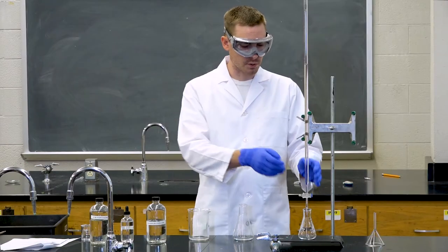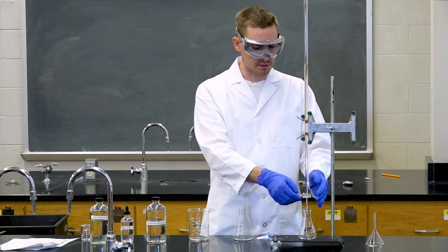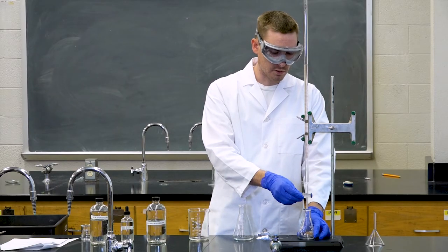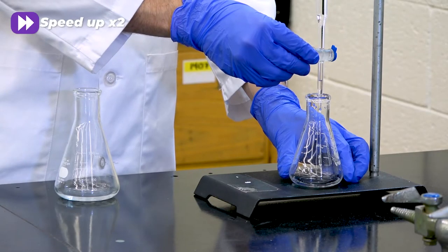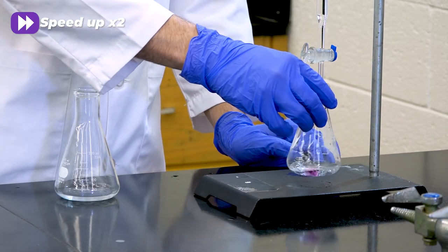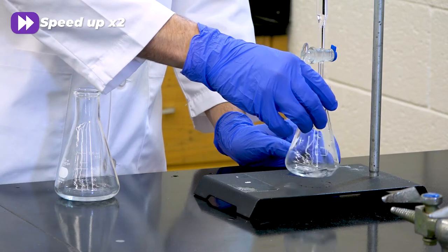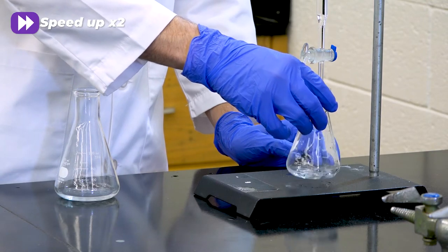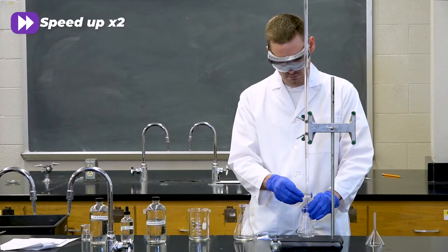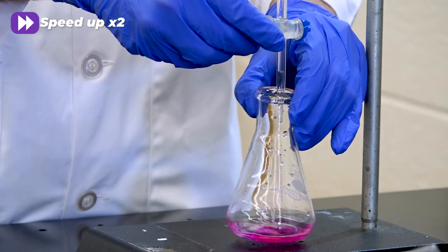So to begin the titration, we're going to be adding our sodium hydroxide solution to our flask, drop-wise. You don't want to add too much too quickly, or else you'll miss the end point of the titration. As you can see, there's some pink color that forms in the solution as the sodium hydroxide reacts with the phenolphthalein. But when I mix it together, that pink color disappears.